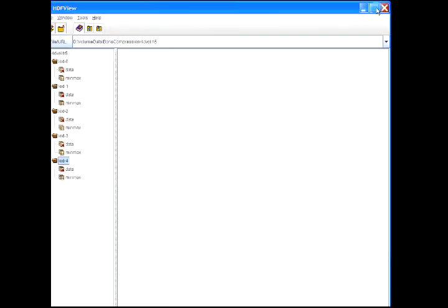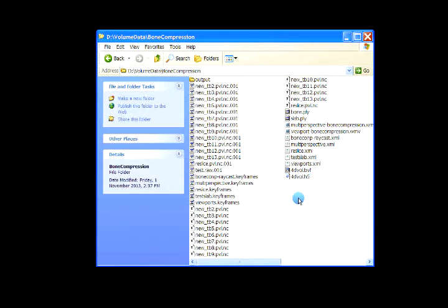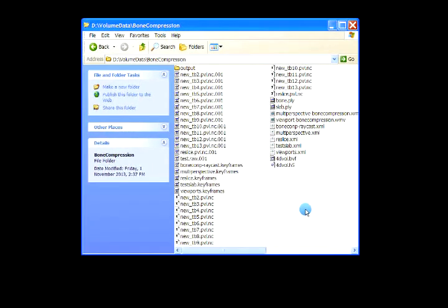The idea is to use those min and max values to select the appropriate blocks for rendering. Now the way rendering happens in the raycasting method is that the blocks that contribute to the final rendering are selected for uploading into the texture memory, and then they are rendered.